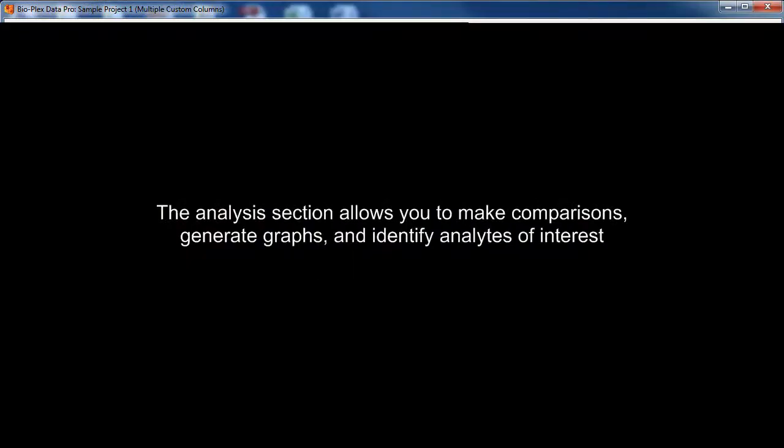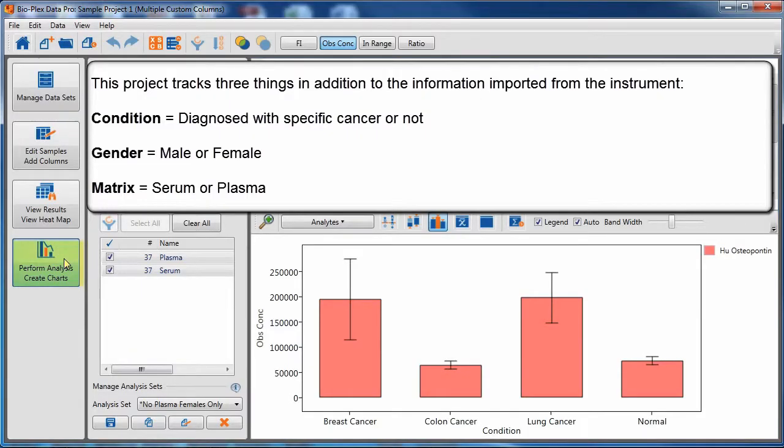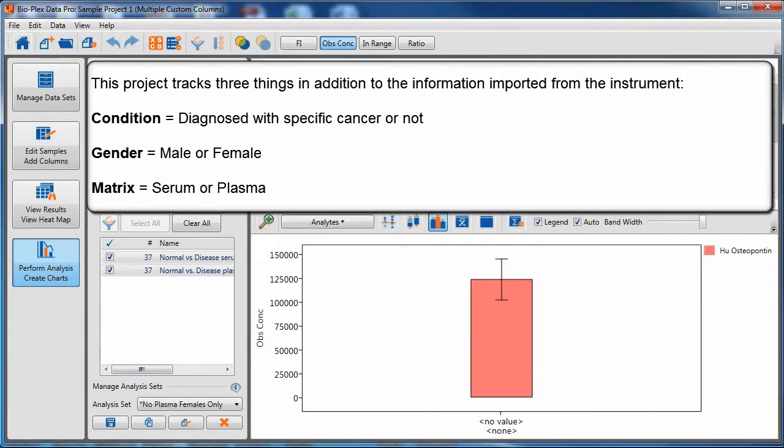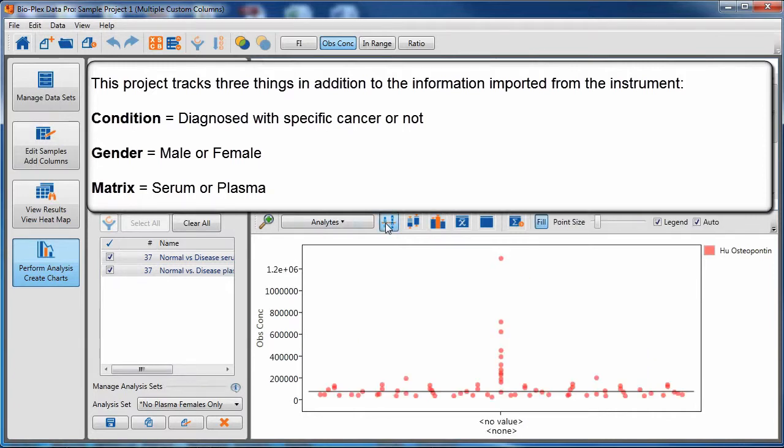The analysis section allows you to make comparisons, generate graphs, and identify analytes of interest to your biological system. Again, this project tracks diagnostic state, gender, and matrix for each sample.